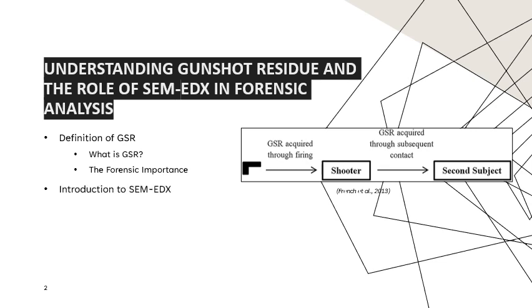Introduction to SEM EDX. So what is SEM EDX? This stands for scanning electron microscopy with energy dispersive X-ray spectroscopy, SEM EDX for short. It is a combined technique that allows detailed visualization and chemical analysis of samples at microscopic levels.